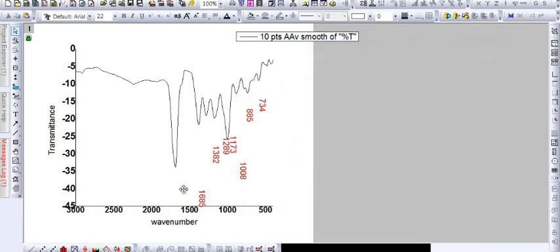Now it looks good. We have to add a small line which marks the peak, and here make it 1.5. Simply copy and paste.